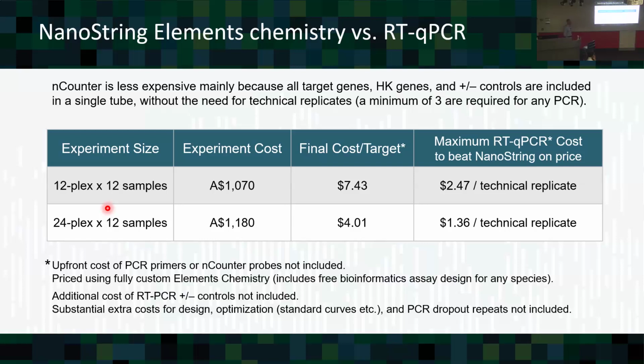Yeah, that's true. No, but seriously, are you aware of locked nucleic acid chemistry? Because I think there's some synthesis that could happen in the nanoString if you apply that and do multiplexing of multiple different type molecules. So out of 12 potential probe pairs, you can amplify hundreds of potential targets, depending on the species and the bioinformatics in the background to understand the transcriptomics in that.